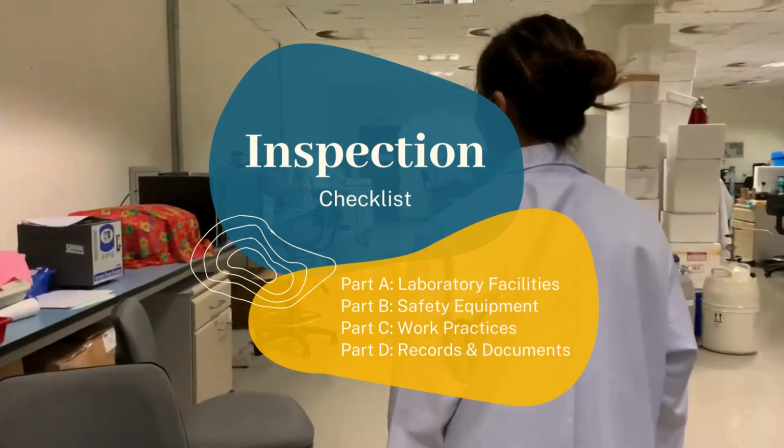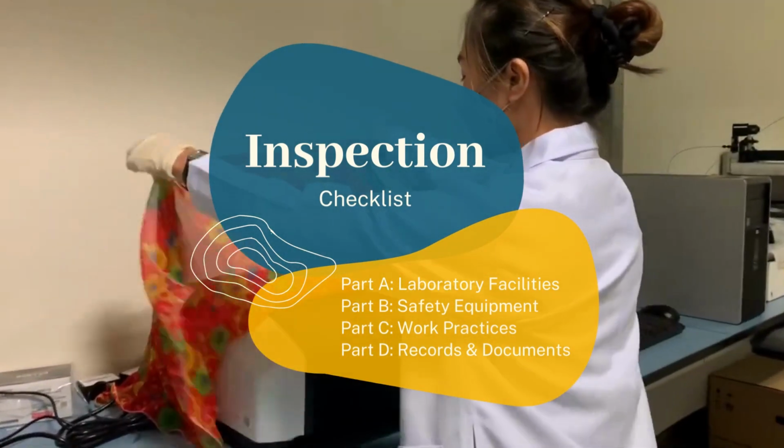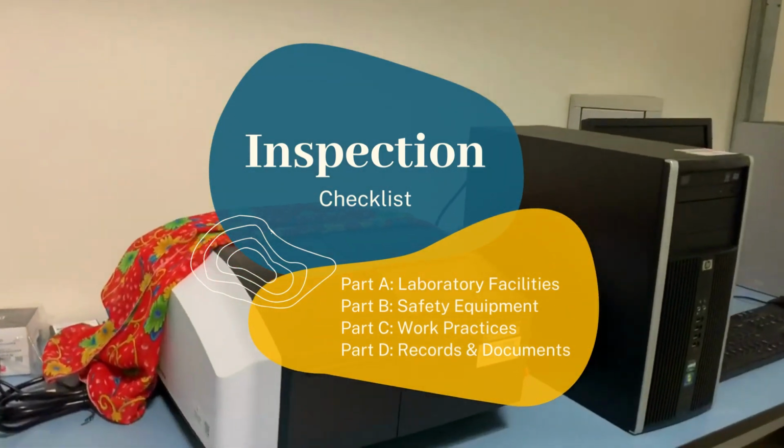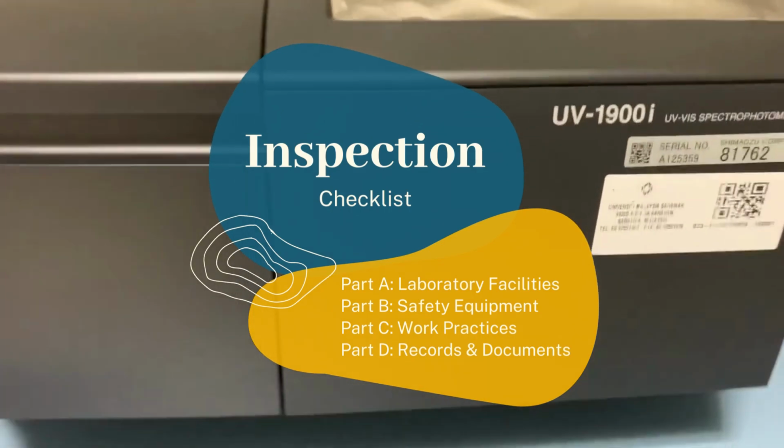Now let us take a look at the inspection result. In the checklist, there are 4 sections. Part A, laboratory facilities. Part B, safety equipment. Part C, work practices. Part D, records and documents.